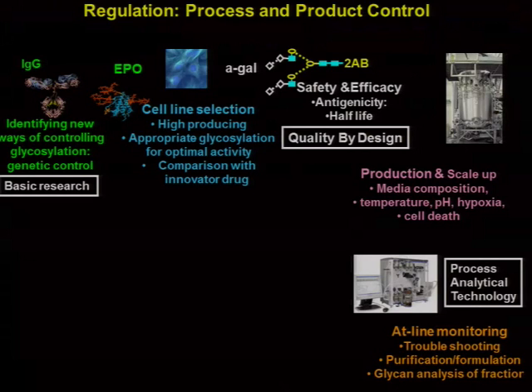But of course it's far more challenging than just having a sensor that will register pH and then send a signal to your mobile phone. You know, it's just not that simple with glycans. So at the moment we're still stuck with at-line monitoring, and you need to do this because sometimes you can actually troubleshoot. If you see that your mannose levels are getting very high, for example, it probably means your cells are exhausted.